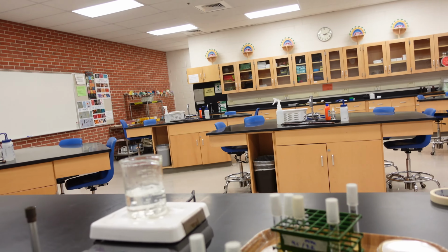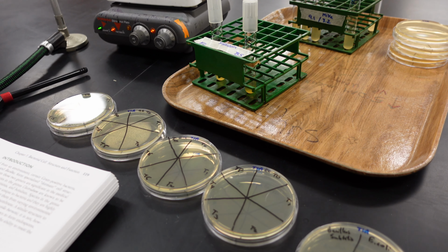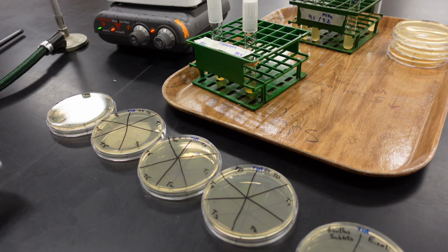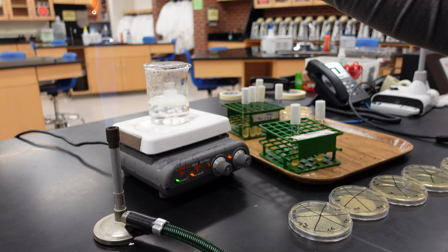So the first thing I'm going to do is I'm going to take a time zero and actually plate the bacteria onto the media to see what it looks like growing before we put in the boiling water as a control. So I'm going to get my loop red hot to be aseptic.